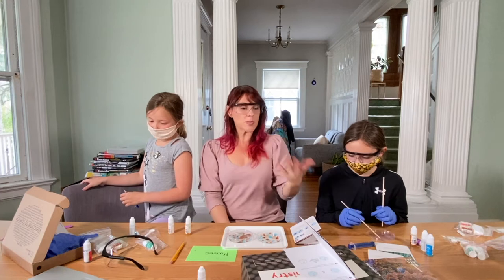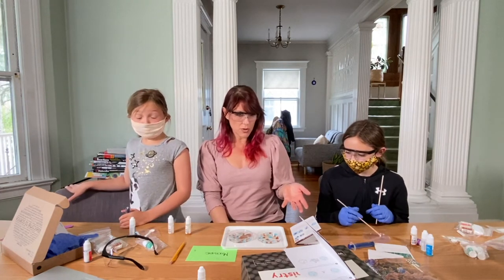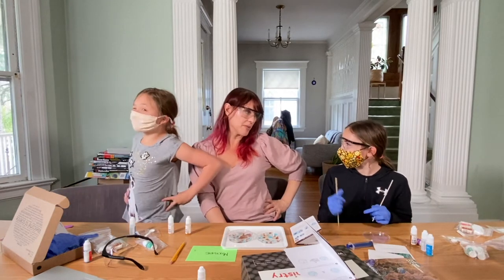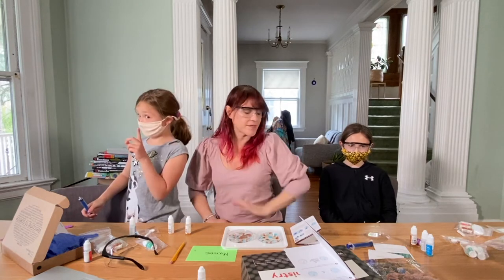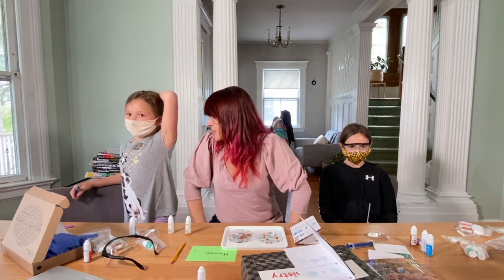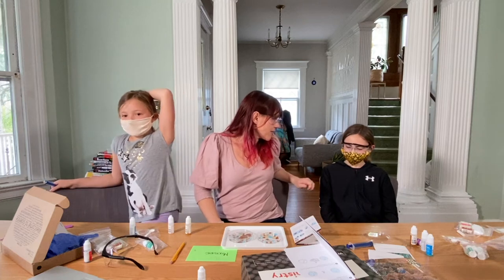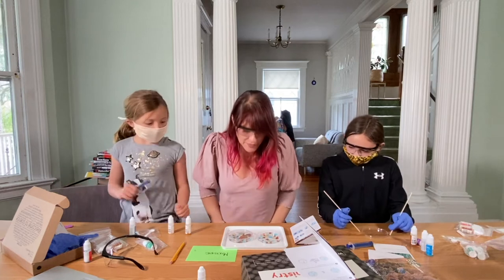So because we're reviewing these kits for other people too, we're going to rate it on my patented — not really patented — five point scale. First thing, on a scale of one to five, did you have fun? Yes. Yes. So you give it a five. Yeah. Was that because you were doing a TikTok dance as well? Yeah, it was. How about you? You did not do a TikTok dance. I thought it was a five for sure. I agree — and I think it looks beautiful.